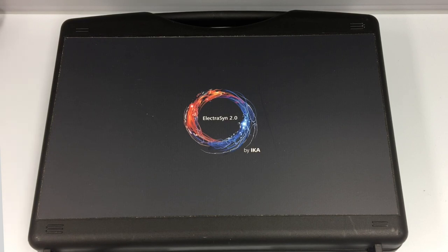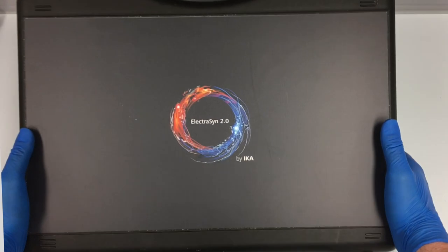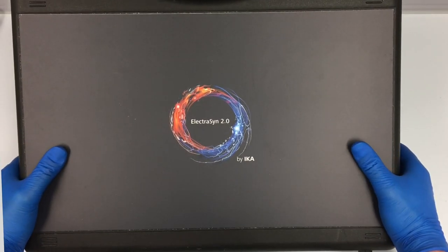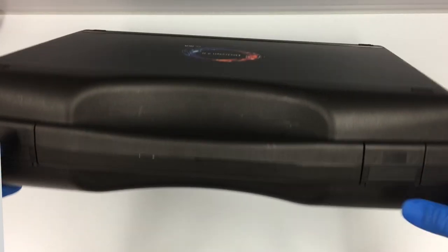Hi guys, welcome to the IKA Electrosyn video user guide. First off, we're going to show you what's included with the IKA Electrosyn and how to set it up from the box. When you order the Electrosyn, it comes with this nice carrying case which you can use to transport it if you ever need to move it around the lab. So let's go ahead and open this up.